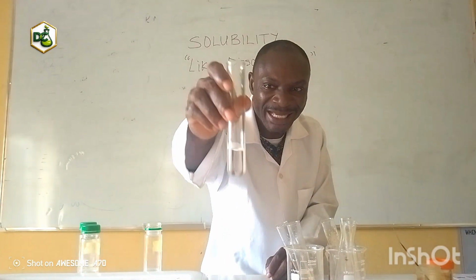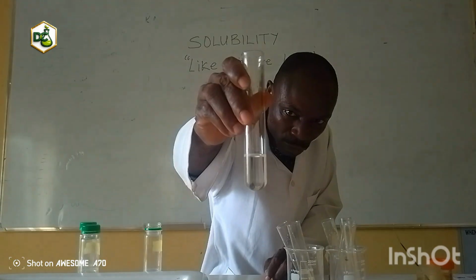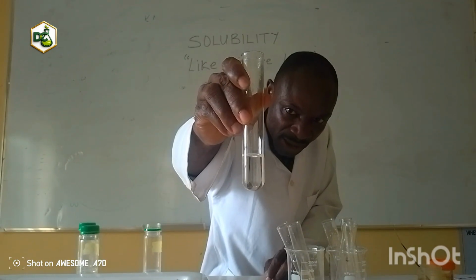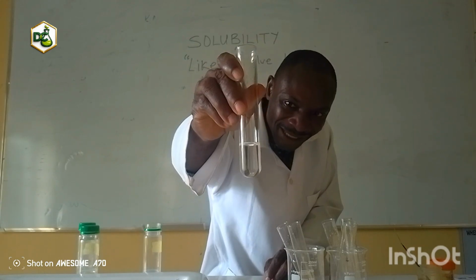So you can see a clear solution formed. There is no boundary. Two liquids mixed, ethanol and water, clear solution.